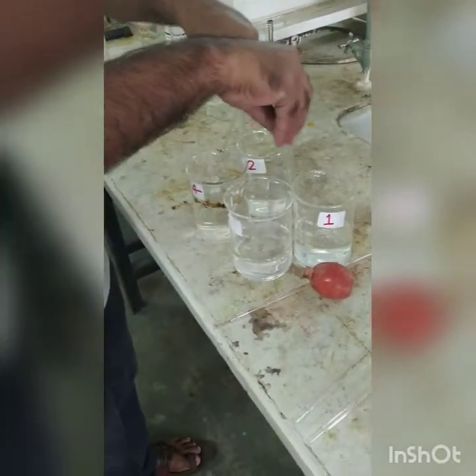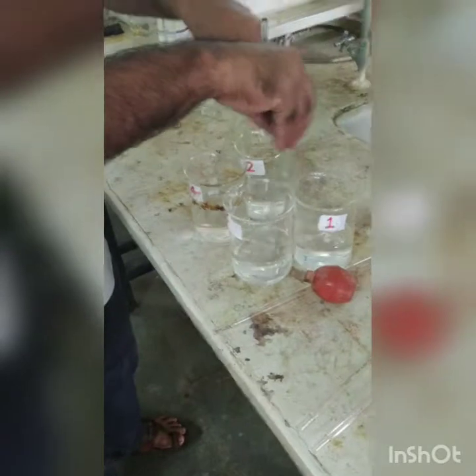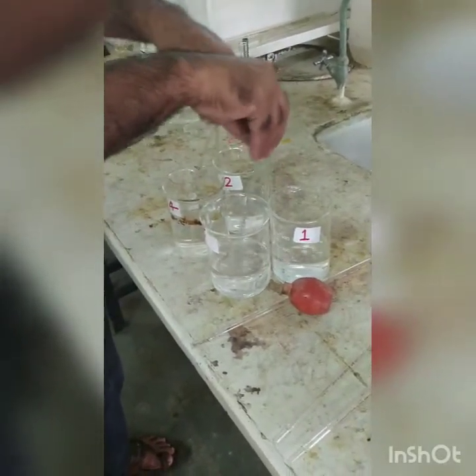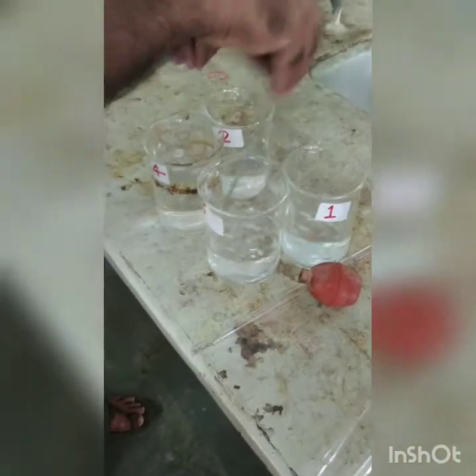After adding the varying doses, now we have to keep it for stirring for 10 minutes. Okay, so stirring will be done for 10 minutes. Now why this stirring? Because when we add chlorine in the water treatment plant, there is also some mixing mechanism used.